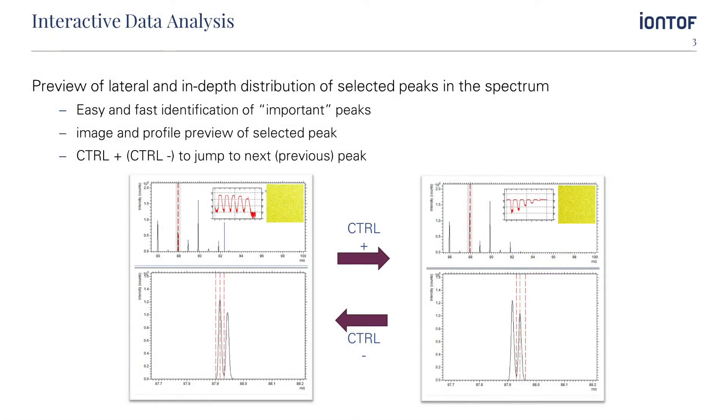Even better, it is not necessary at all to add a peak to the peak list. The new preview windows in the spectrum view show the spatial distribution of the mass interval as soon as it is selected. With pressing Ctrl and plus or minus you can jump to the adjacent peaks for a fast and easy identification of important masses.